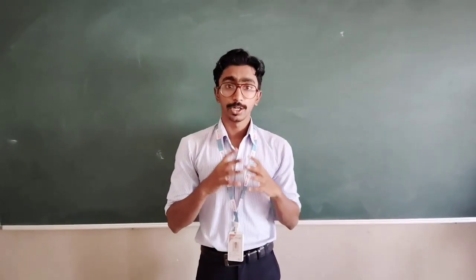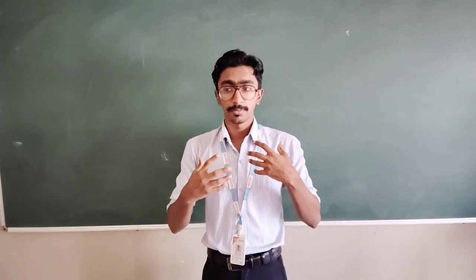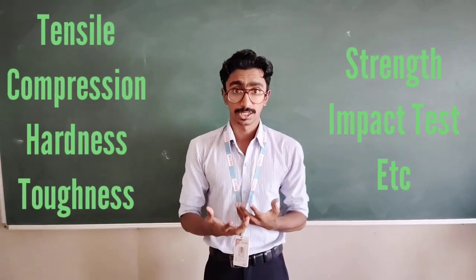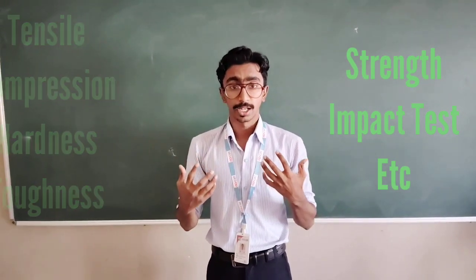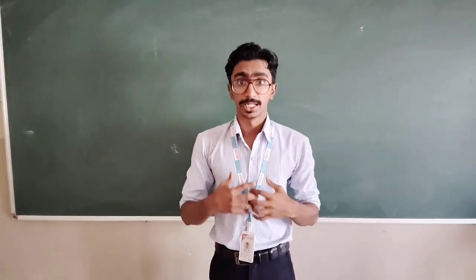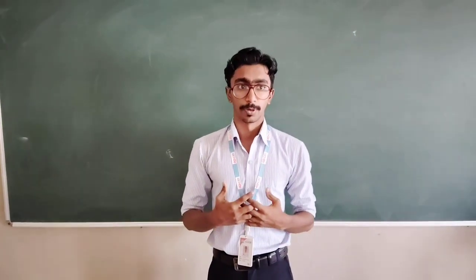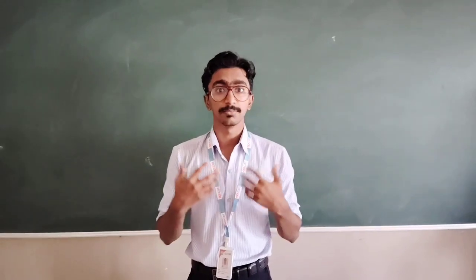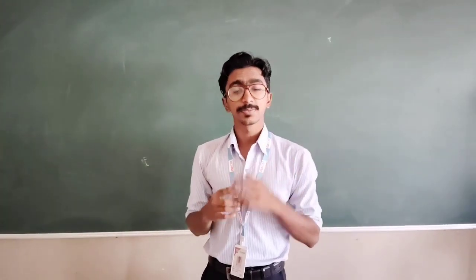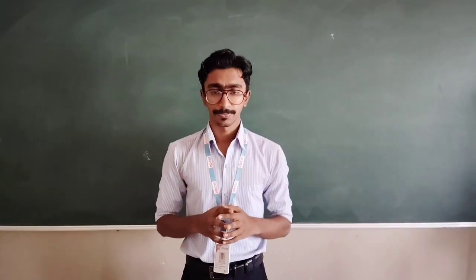In order to test a material, there are many tests performed, like tensile tests, compression tests, hardness tests. Then also tests based on chemical properties, physical properties, mechanical properties, even electrical properties. One of the properties that we are going to see today is the mechanical property, and in it, we are going to see hardness.